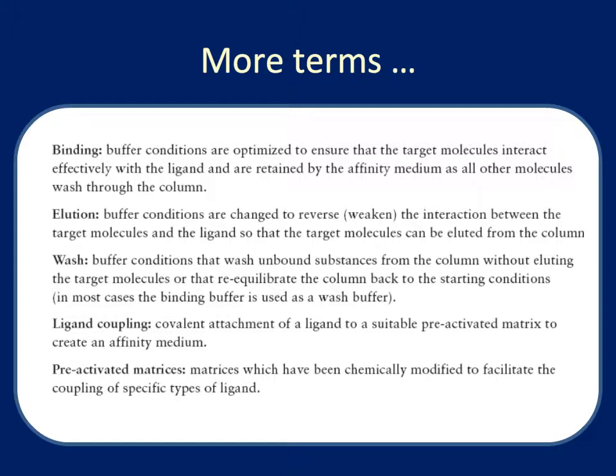The wash is the step in which, after you bind all of your molecules in the mixture to the column, you can then wash the proteins that don't interact with the ligand off the column, so that all that's left behind is your protein of interest.